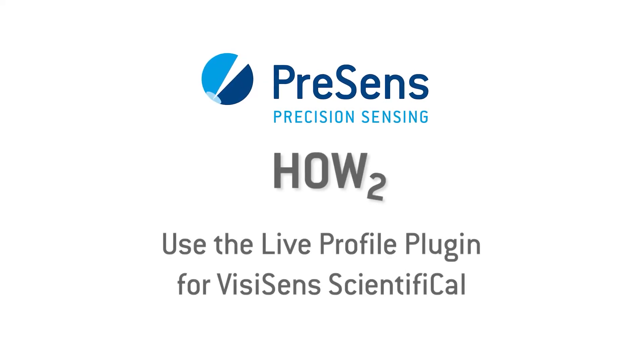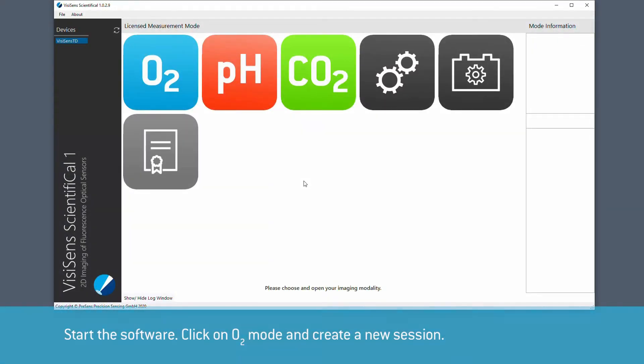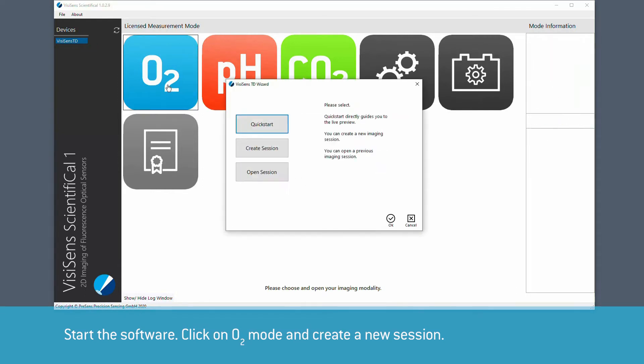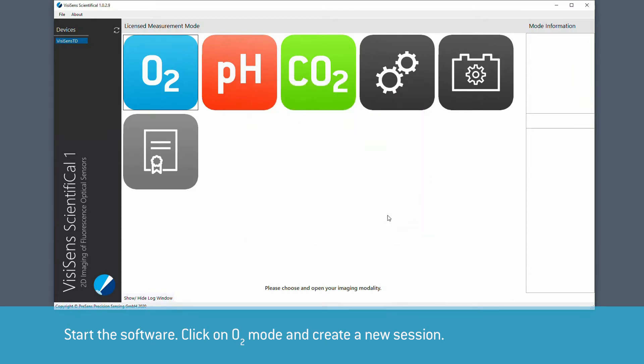The live profile plugin allows multi-gradient evaluation during recording or of previously recorded data. Here we show how to use this plugin. Start the software, click on O2 mode and create a new session.